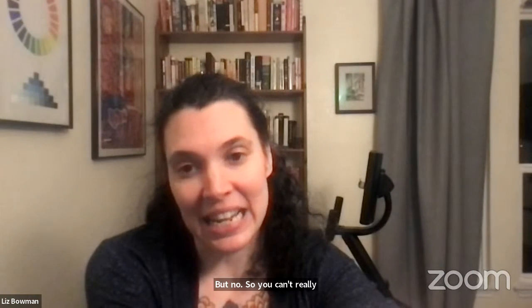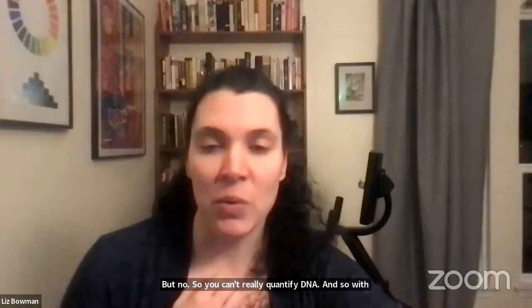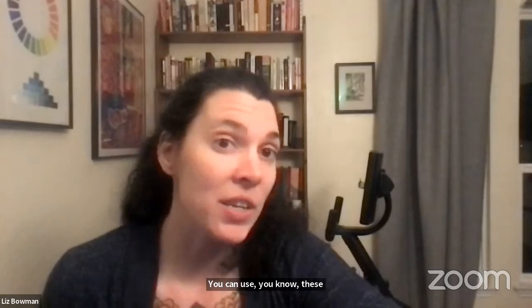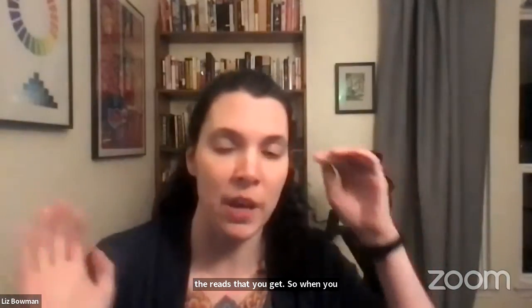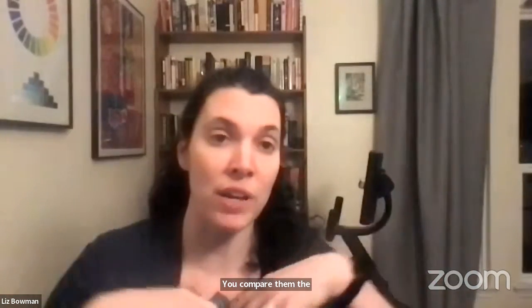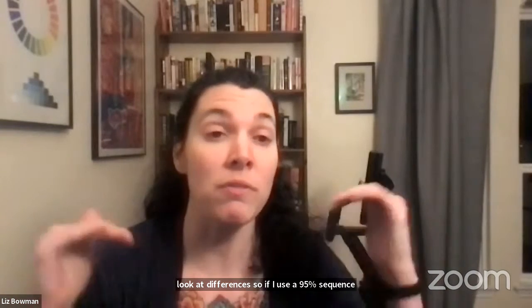But no, you can't really quantify DNA. With bacteria, which in my opinion are much easier to work with, but a lot less interesting, you can use these environmental sequences, the reads that you get. When you get all of these reads back, you end up with hundreds of thousands or more. You compare the sequences, the bases in them, and look at differences.